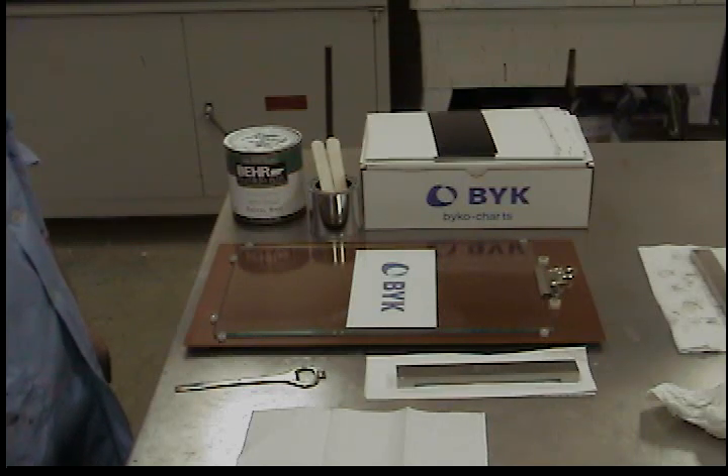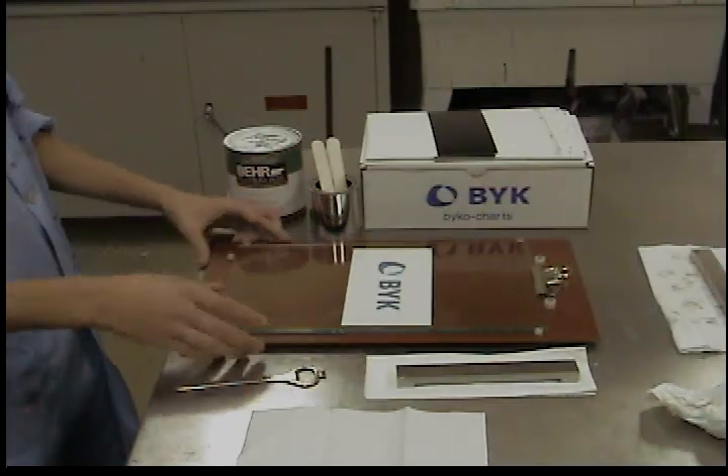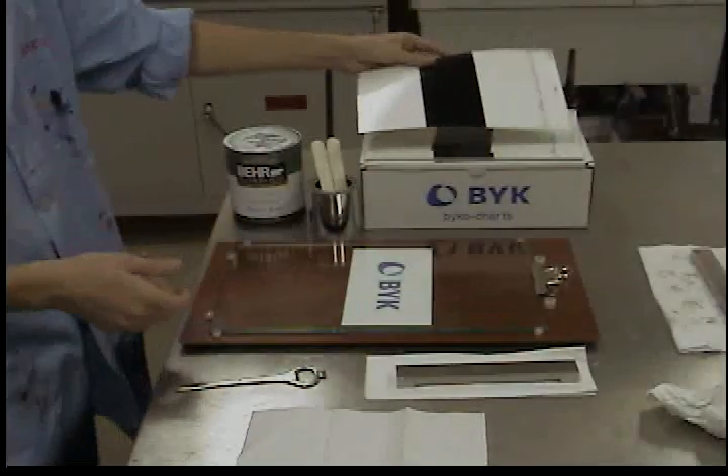For this test you will need a drawdown plate, an appropriate Bicco chart, and a bar type film applicator.